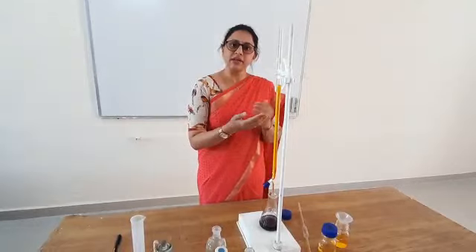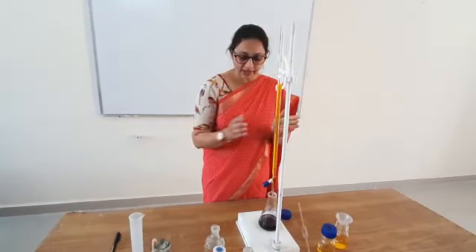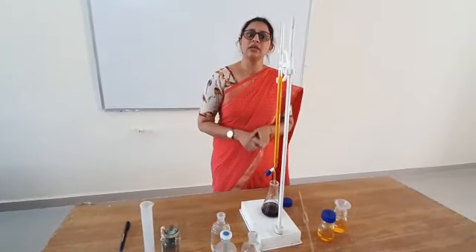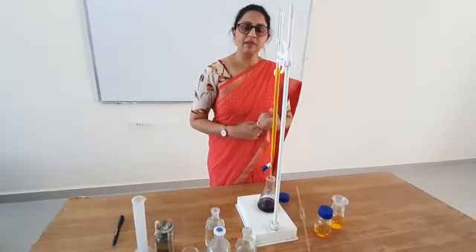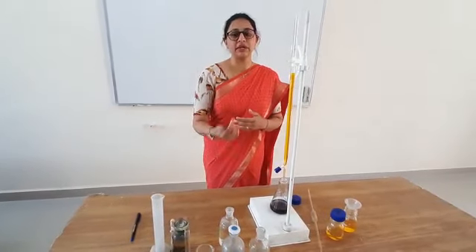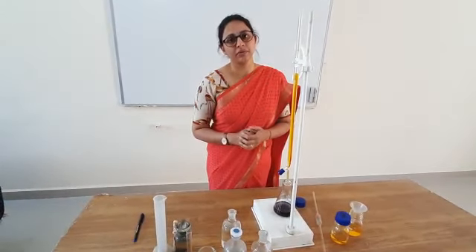For the next practical, this will be our standard potassium dichromate solution. Instead of known ferrous ammonium sulfate, we will take the unknown ferrous ammonium sulfate and repeat the titration again with the internal indicator diphenylamine. Thank you.